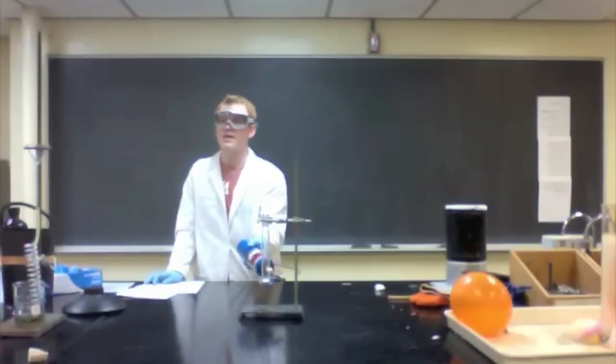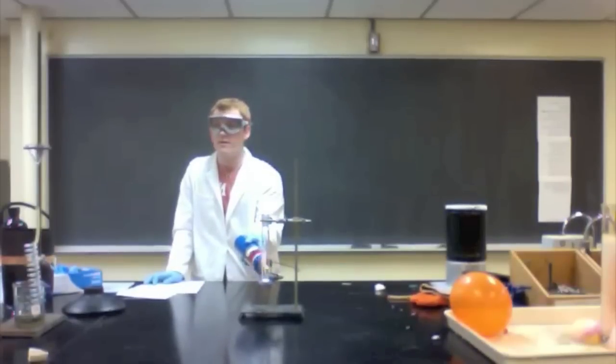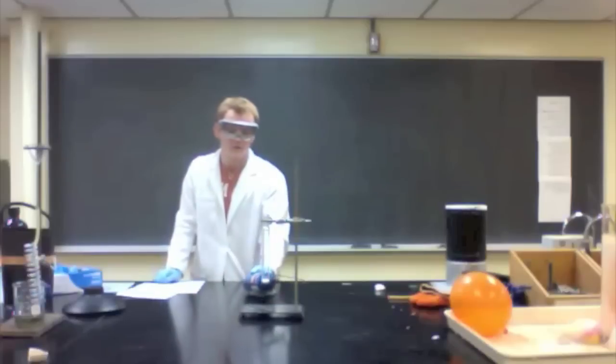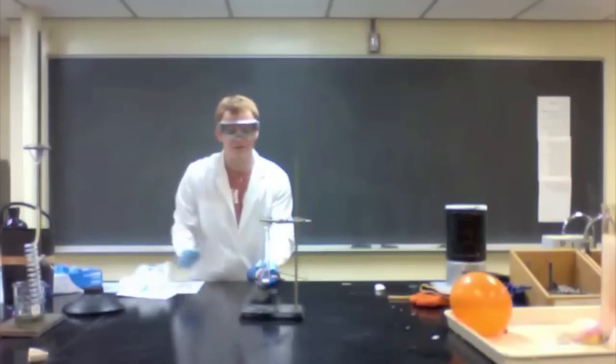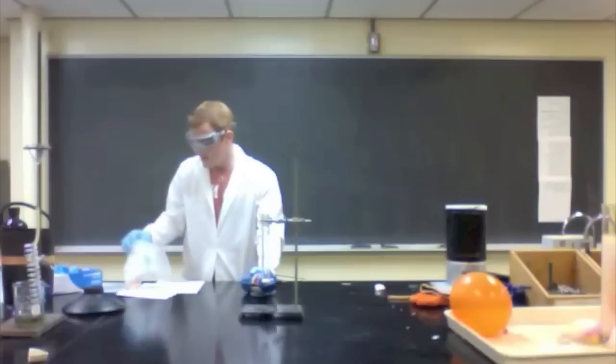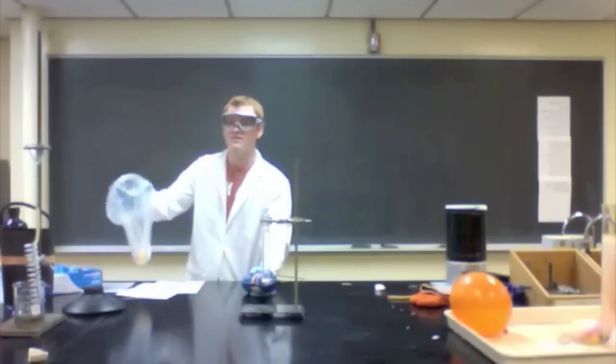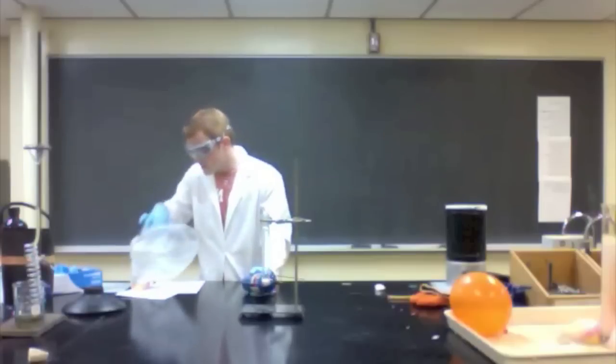Okay, so in the bottom of this test tube I have potassium chlorate. What's going to happen now is that this solid potassium, which is an ionic solid, so its melting point should be really, really, really hot. So what's going to happen now, it's going to start to melt. Then once it melts, you'll start to see a lot of bubbles be given off and those bubbles are oxygen. So it's going to decompose. And then so what's going to happen now, I'm going to have really hot oxygen with catalysts, and then I'm going to throw in a burnable source.